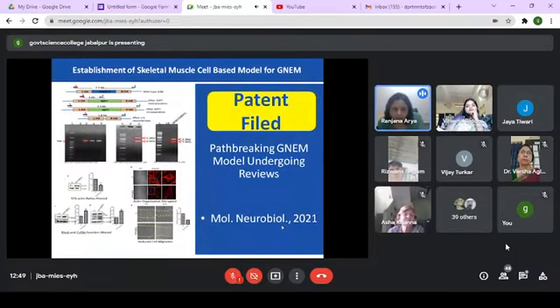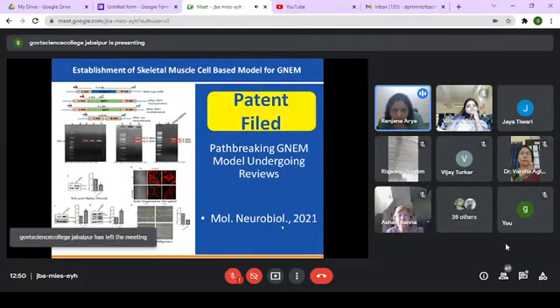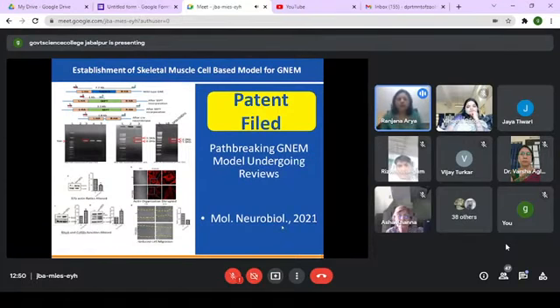So we have now filed this patent, and if you can see here, with actin you can see striations in the muscle cells. But when we are looking at the mutation or the cell line which is knocking out GNE, you lose these striated patterns and actin is totally disorganized. So we have a good success over here, and this seems to be a good model to now test all our drugs and molecules, to see how they can be beneficial for the cells where you have defective skeletal muscles. Next, please.